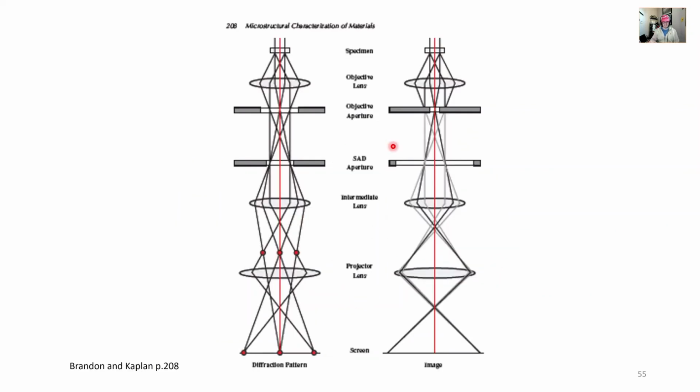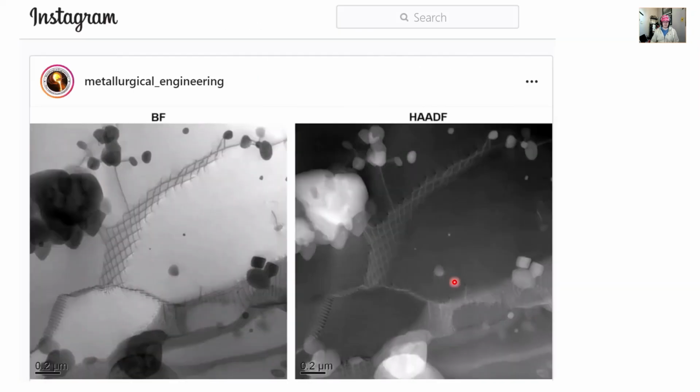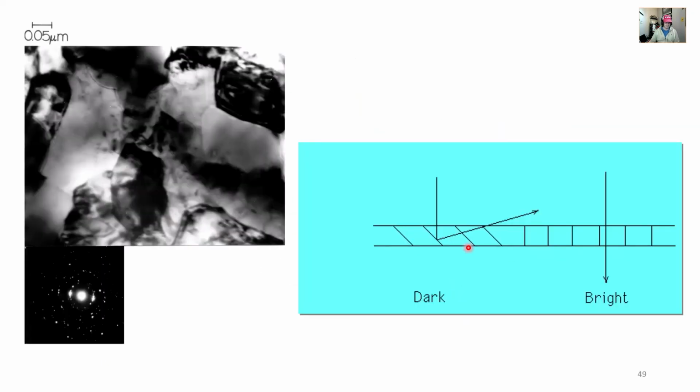If you combine the two schematics into one schematic, it's more like real life. So here, imagine you have a diffraction spot off the axis of your transmitted beam. You move your aperture so you're creating the image off of that diffraction spot. So let's go up here and find a diffraction pattern. That's not a very good diffraction pattern. Let's use this one because I already talked about it. So the image here is created by this beam. We put in our aperture and we make our image off of this beam, okay?